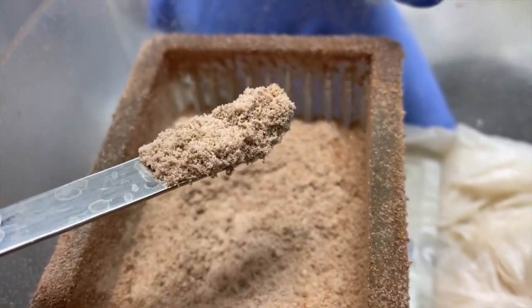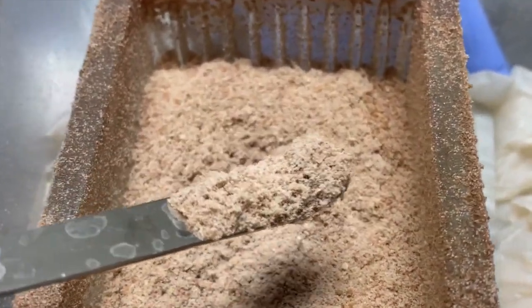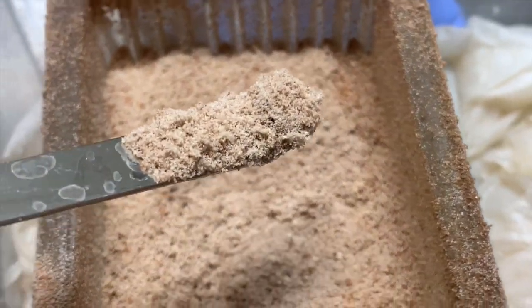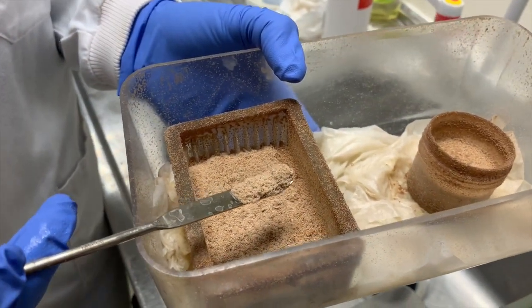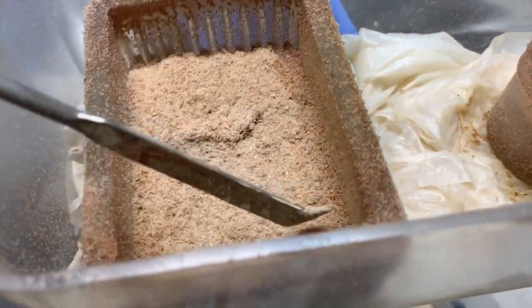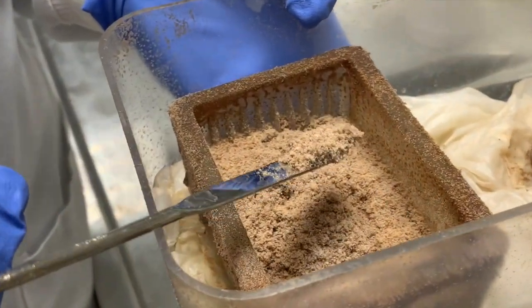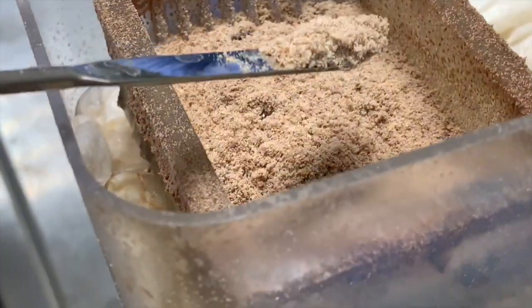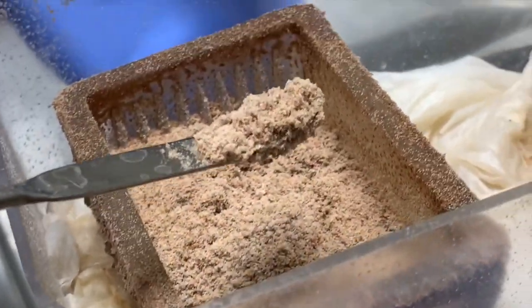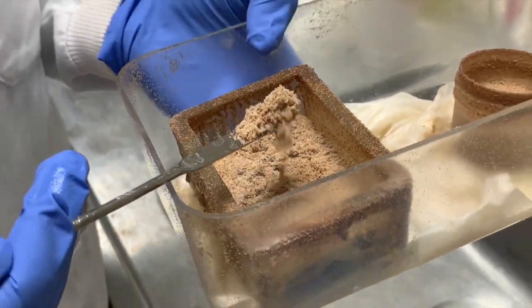So are you telling me there's tens of thousands of mites there? Actually millions in this container. There are millions of mites and you normally find them in your stored food, like in cupboards and kitchens. They're easily overlooked because they're usually encountered in crime scenes, but forensic investigators very often miss them and think that it's just moving dust. This leads to them missing valuable evidence.